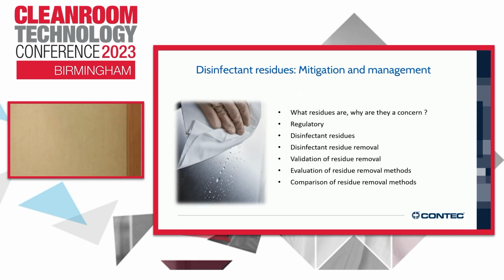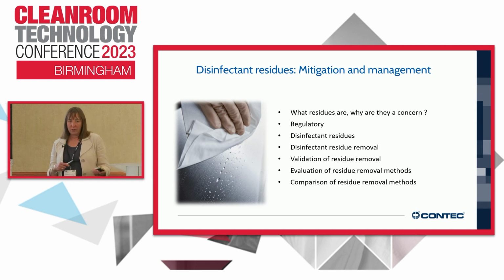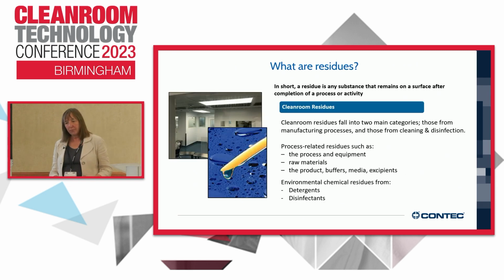So the presentation will cover just a little bit of background into residues, and then go into how we're going to remove it, and how we're going to validate that we've removed it, because it's not really easy. And we'll look at some different methods that we've tried and see what effect we have.